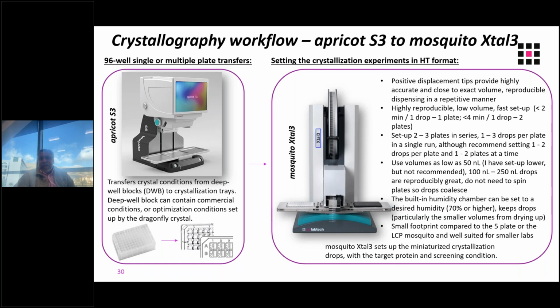So this would be a very simple, very elegant, and an ideal workflow, which you can consistently set up in a very fast manner and also in a high throughput fashion to screen a large array of conditions for your particular protein of interest. Next slide, please.